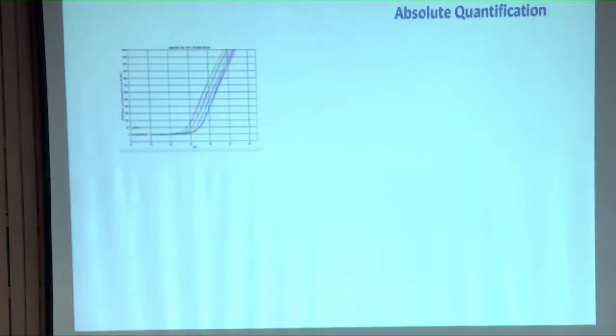So what you do, you start from a theoretically very low quantity, maybe a picogram level, and go up to the nanogram level and make different concentrations, maybe 1 picogram, 10 picogram, 100 picogram, 1000 picogram, you go up to maybe, let's say, around 10 nanograms, or even up to, let us say, 100 nanograms, right? And each one of them is subjected to PCR, right? Now you set up a qPCR.